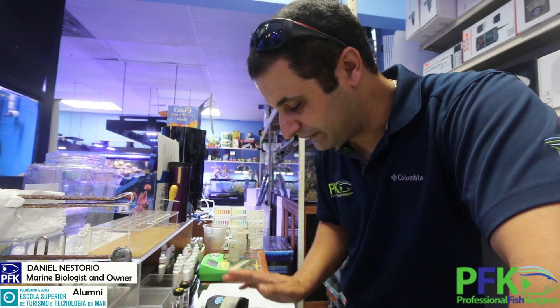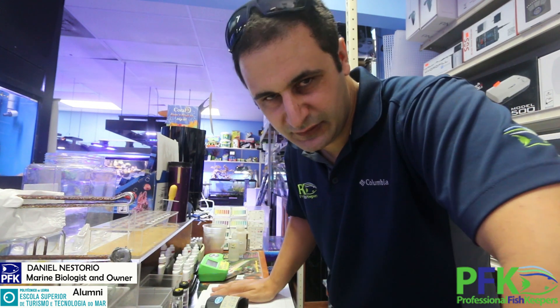There's the D900 now which is pretty cool, but I'm happy with the D890. There's also a smaller unit that just does copper only, so if you want to use that one, by all means.